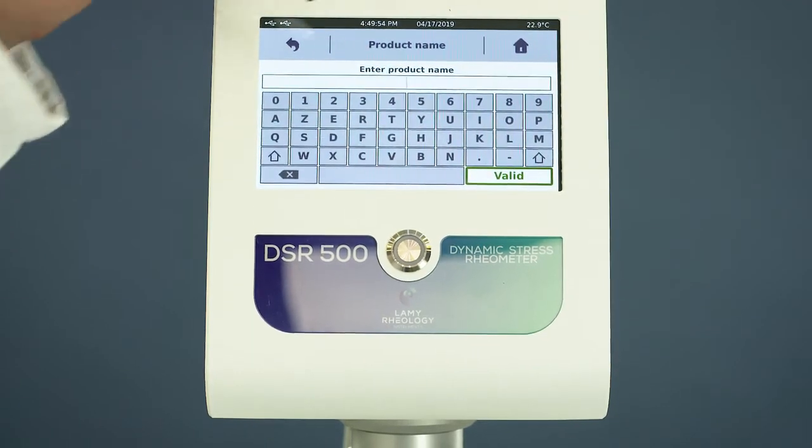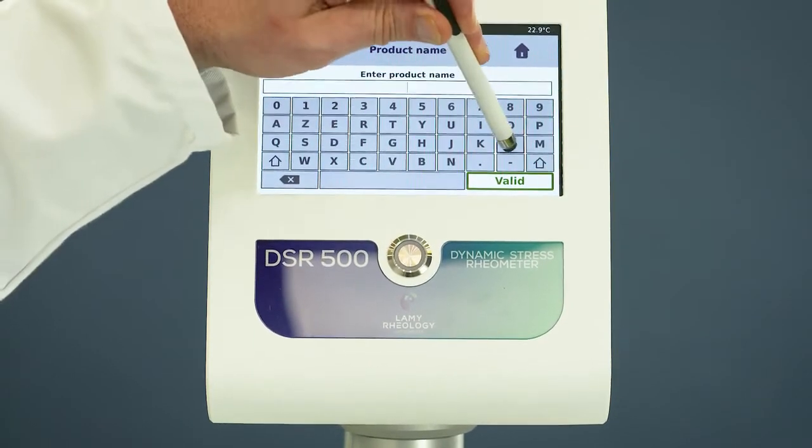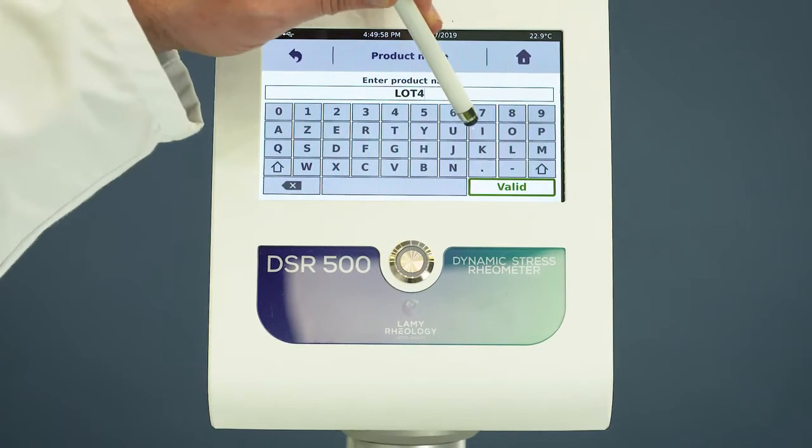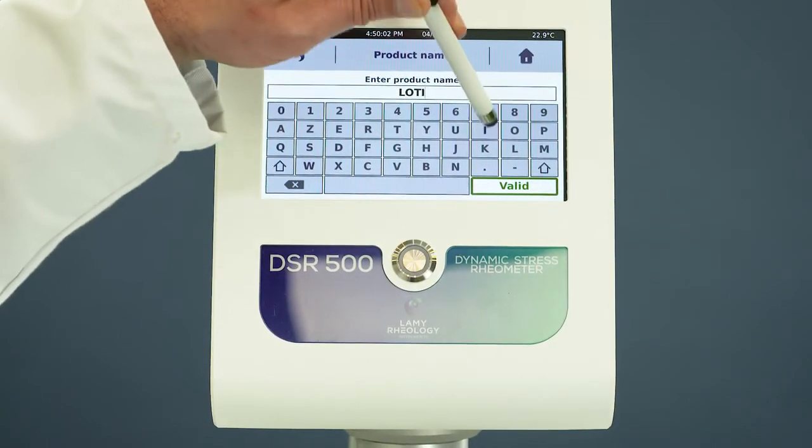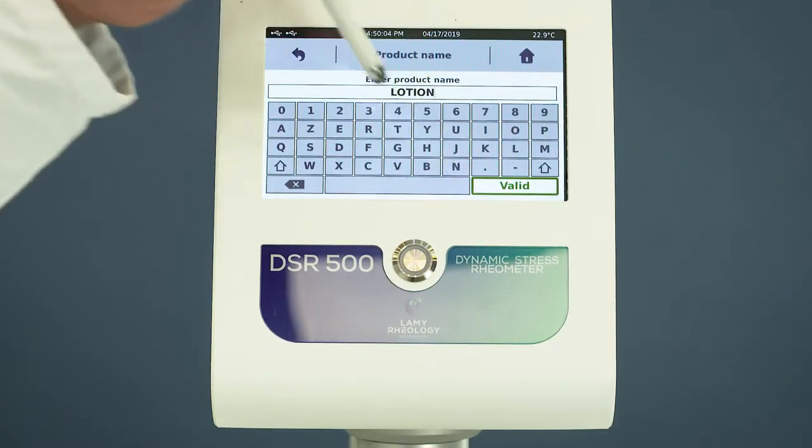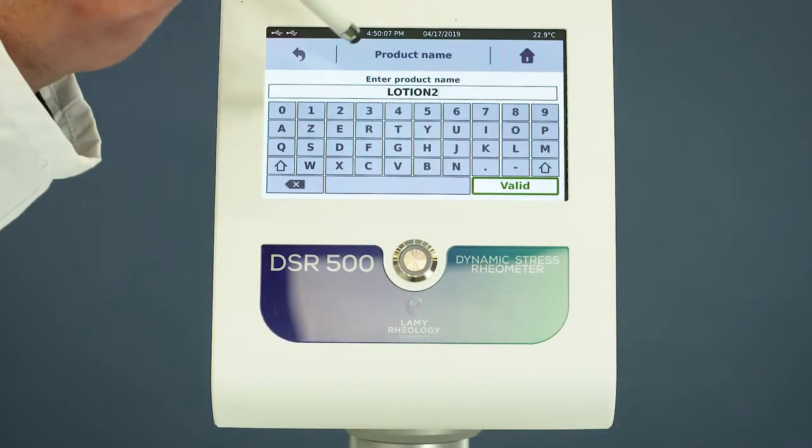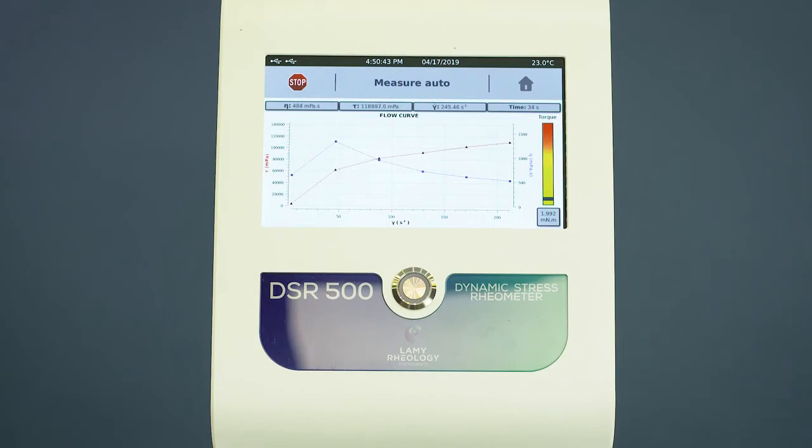Click start and set the name of the file. DSR 500 starts the test and shows you the curve directly on the display.